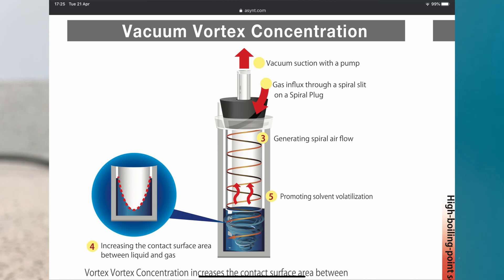In this diagram you can see the plug in a tube. We pull a vacuum through the centre, which then pulls air in from outside of the tube via the spiral groove in the plug. That creates a vortex of air — or gas — within the tube, pulling the liquid up to the side walls, creating a thin film and evaporating very quickly and efficiently.